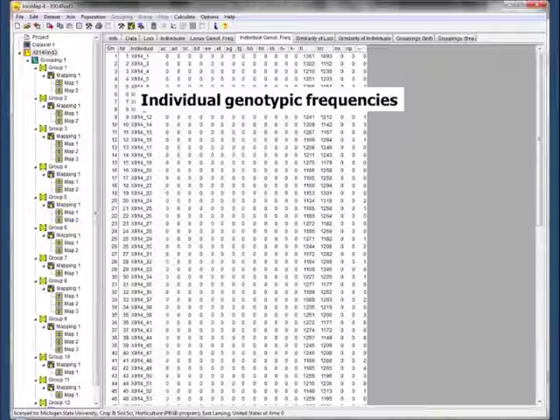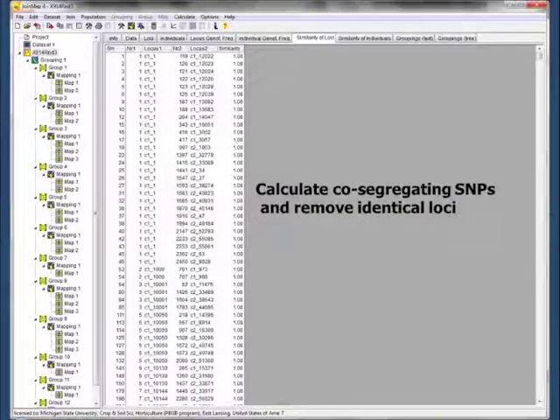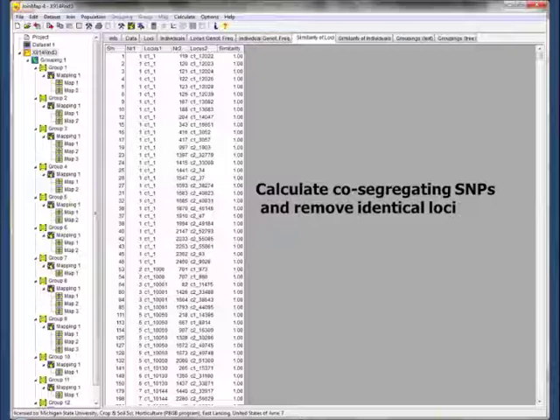Another way that you can look at the data is the individual genotypic frequency. You can see the progeny here going across — what it's doing is seeing how many fell into the different homozygous or heterozygous SNP category. The last column is the number of missed call SNPs — the ones where there was no call. So if you were seeing some progeny where there were a lot of missed calls, you might want to consider removing those because maybe they're not that good.